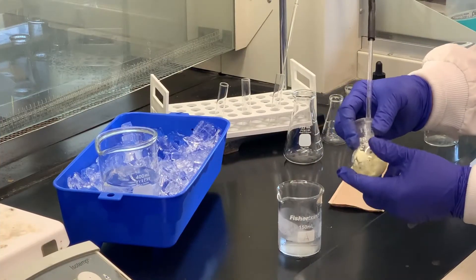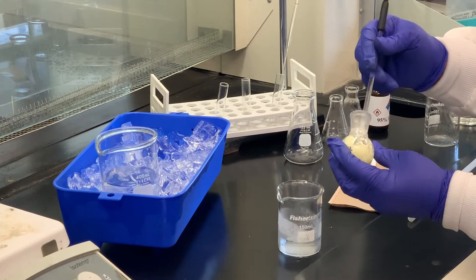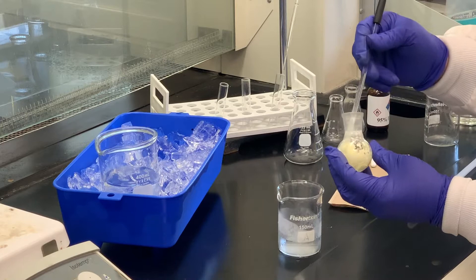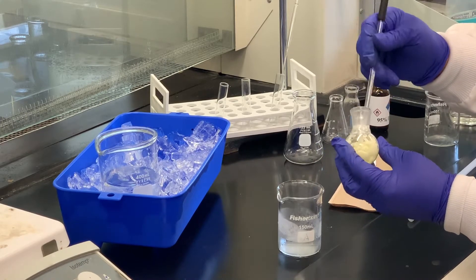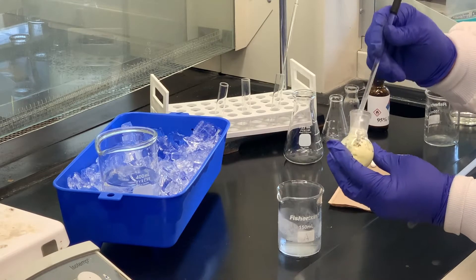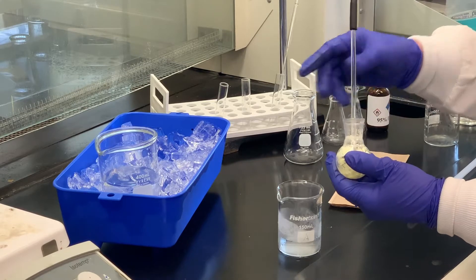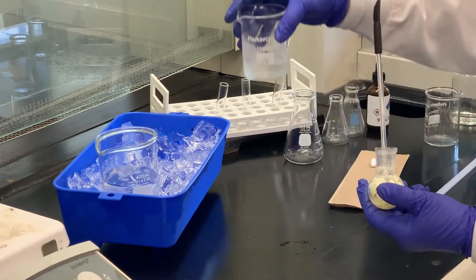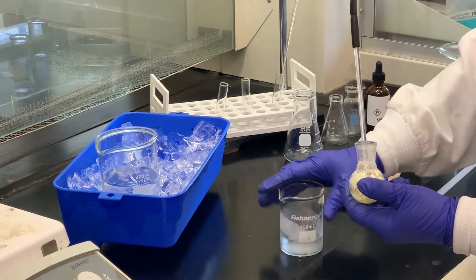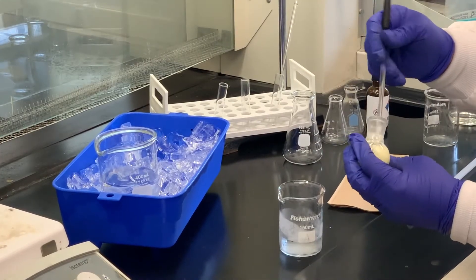This is the round-bottom flask that we did the reaction in. You can see there's quite a bit of solid. There's a little bit of liquid — could be some unreacted bromobenzene and also the mixture of nitric acid and sulfuric acid. The stir bar is still in there. I'm going to leave it in until I pour it into this beaker that has about 40 milliliters of cold water that's been chilling.